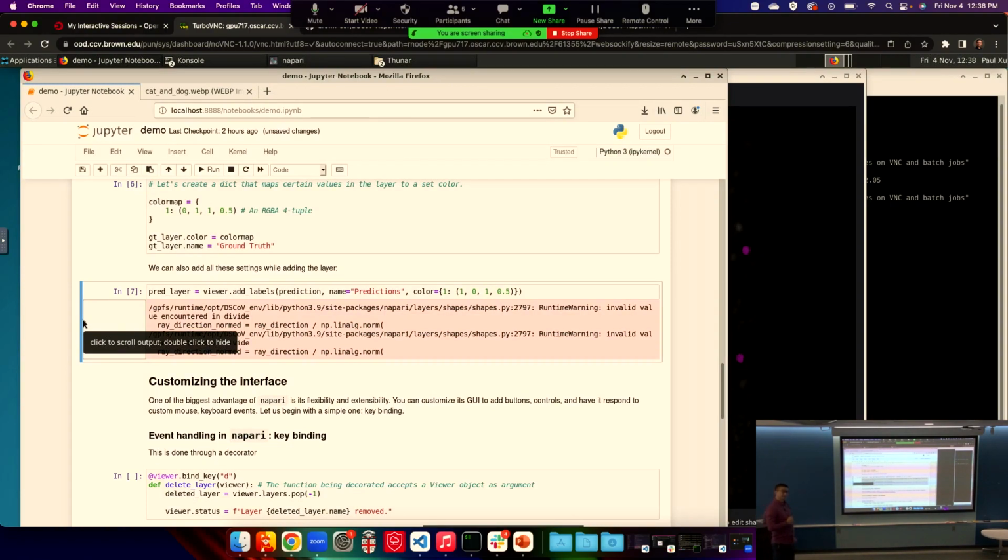Multiple time steps of the same data set and just constant kind of animation between those two? Yes. Are you saying that multiple images from different frames? Yeah. Those data set on multiple time steps. Yeah, going through them, you can definitely do that.